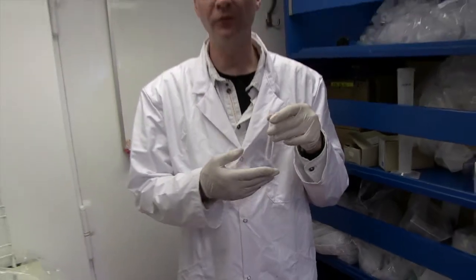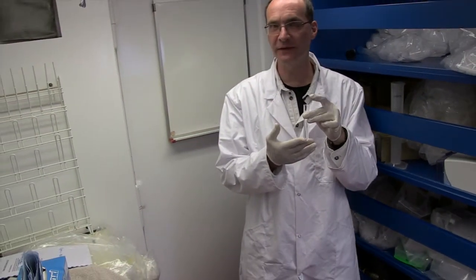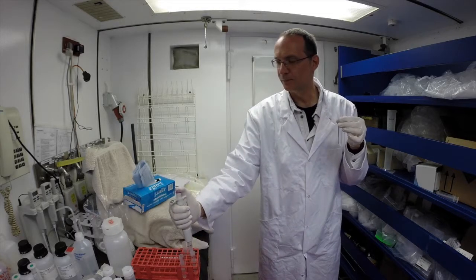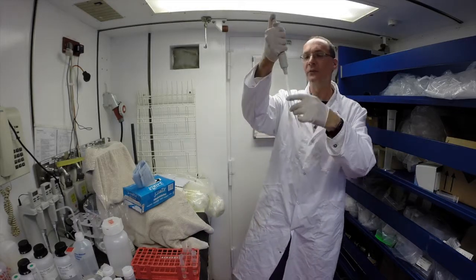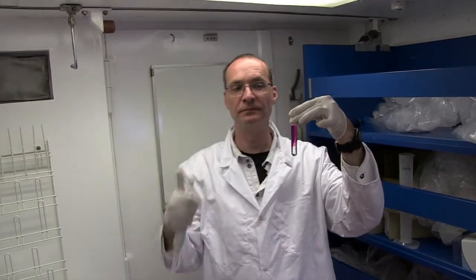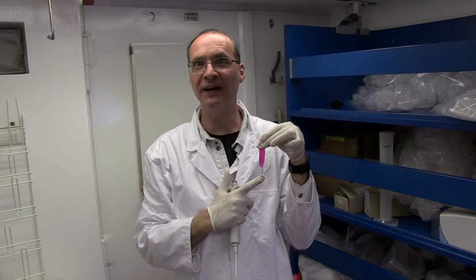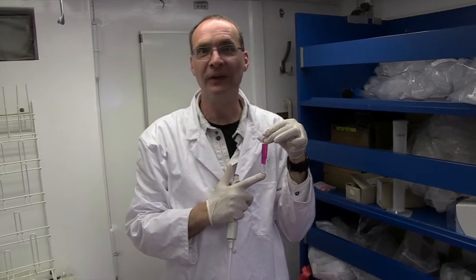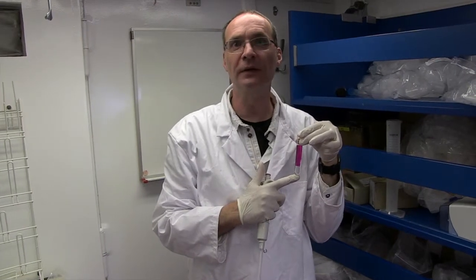We will simulate one of the color reactions for the nutrients in this test tube. We add the reagent to the sample and the reaction takes place. The analyzer can accurately determine the concentration of the nutrient based on the intensity of the color.